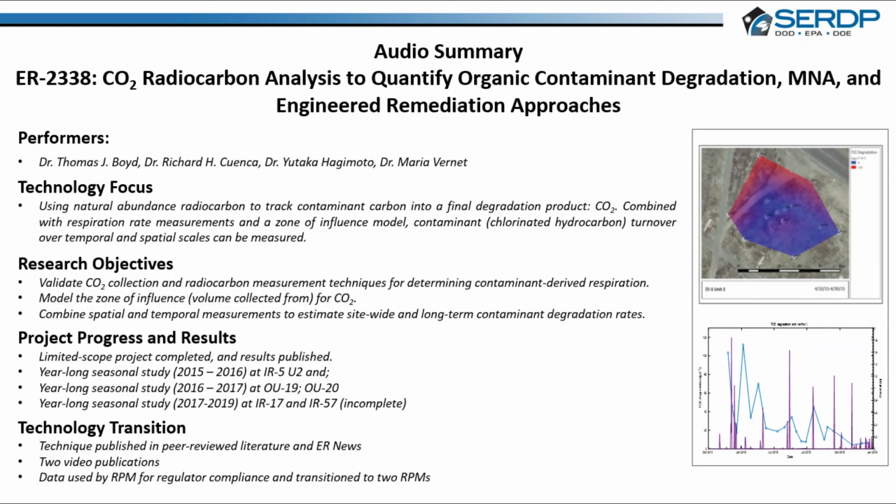Radiocarbon analysis may be considered relatively expensive compared to other single analytical measurements, but as stated is definitive, and with advances in technology, costs are becoming very reasonable. For instance, gas source AMS measurements are now less than $60 each. At this level, the cost-benefit ratio for this technology is very high.